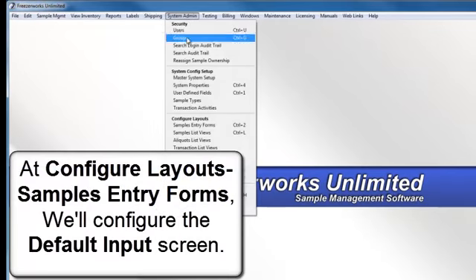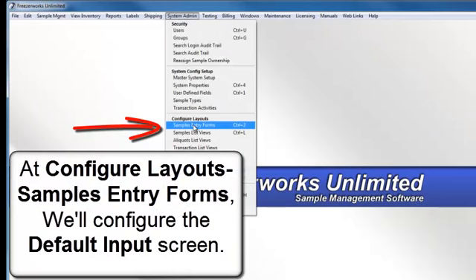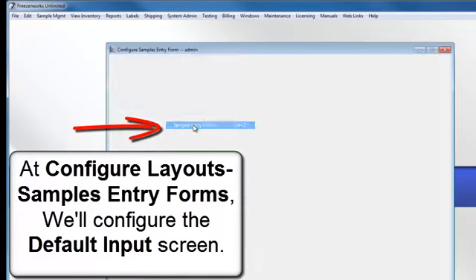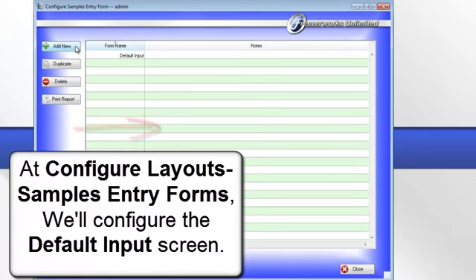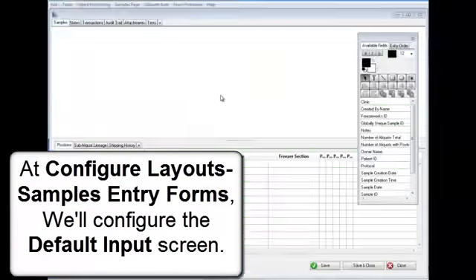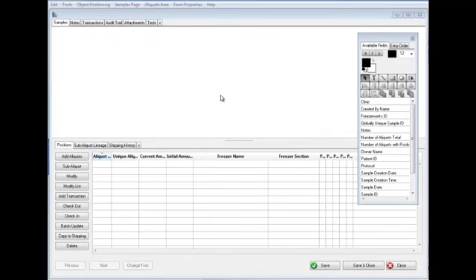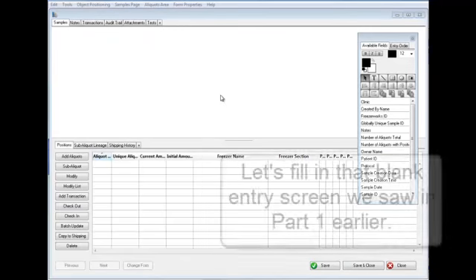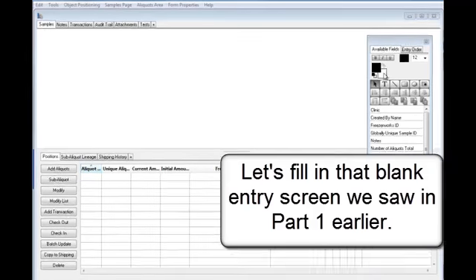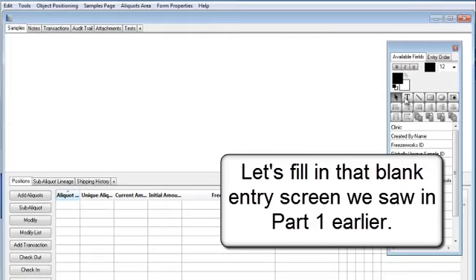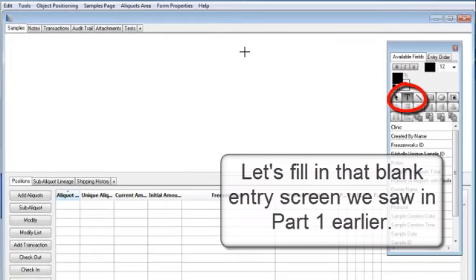At Configure Layouts Sample Entries Forms, we configure the default input screen. Let's fill in that blank entry screen we saw in Part 1 earlier.